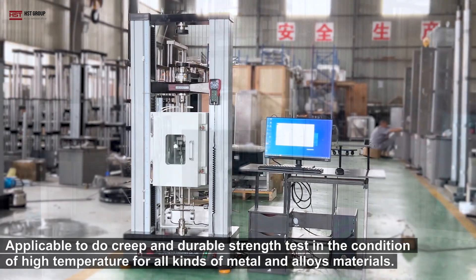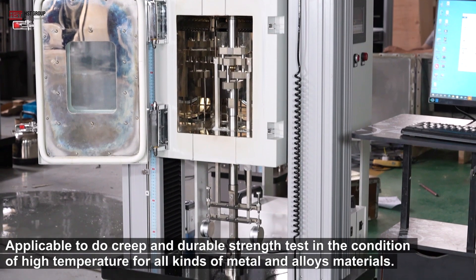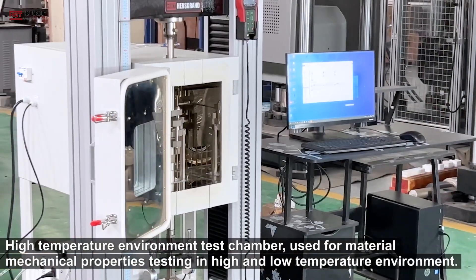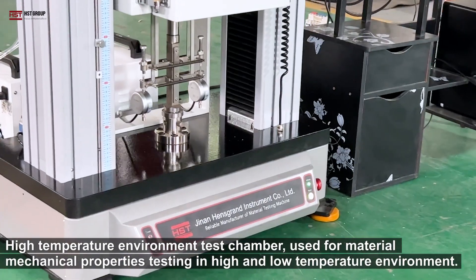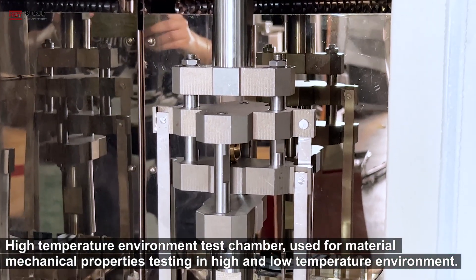Applicable to do creep and durable strength tests in the condition of high temperature for all kinds of metal and alloy materials. The high temperature environment test chamber is used for material mechanical properties testing in high and low temperature environments.